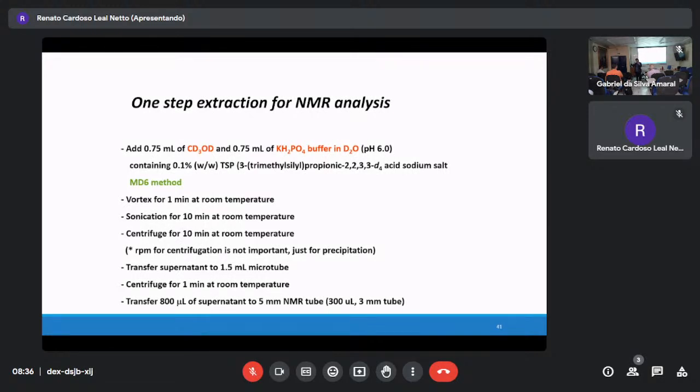That is why we evaporate and reconstitute, because we want to increase the concentration. Say I extracted 1 kilogram, and then I dried it up and added 1 milliliter, which means your compound concentration is increased. But this one has no evaporation step, no process.